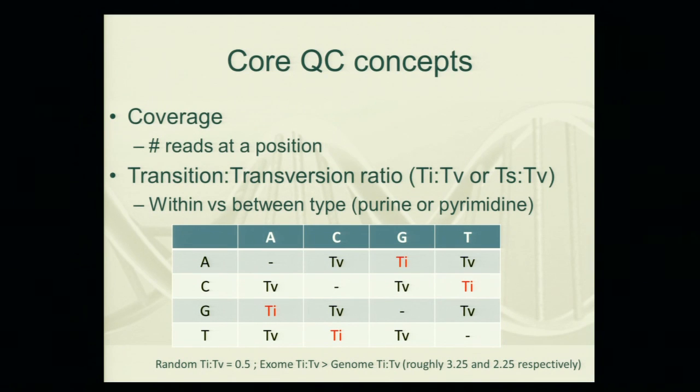So the question is what is the nature of this coverage, and the way the technology is working is not uniform with respect to certain sequence contexts and so on and so forth. So two years ago, I looked at the coverage across the exome as a function of the GC content, and the more GC content that you had, so when you were very high in GC content, the worse off the coverage was as a general rule. Now, there are also places where when GC content goes very low, that's sometimes weird, but that may have to do with lack of specificity of the sequence itself. So it's not independent what is being captured from experiment to experiment.